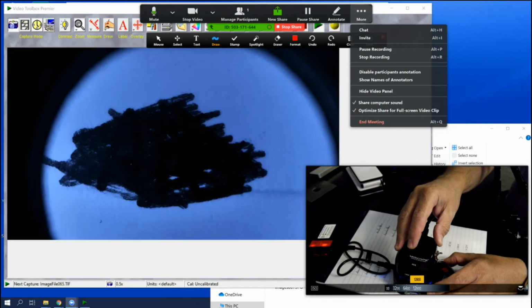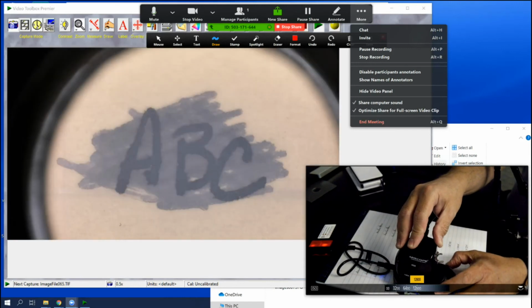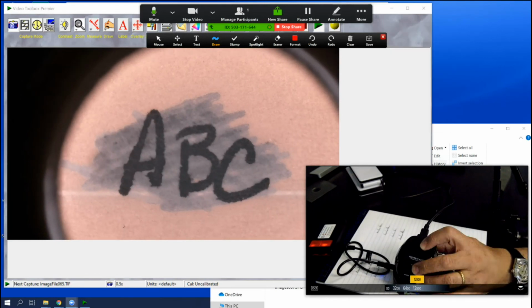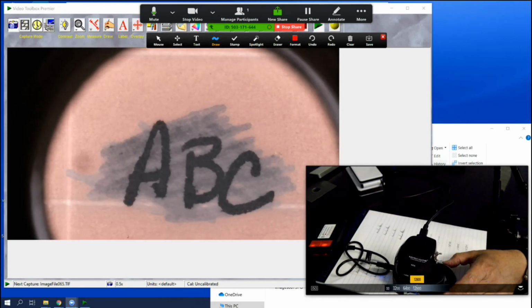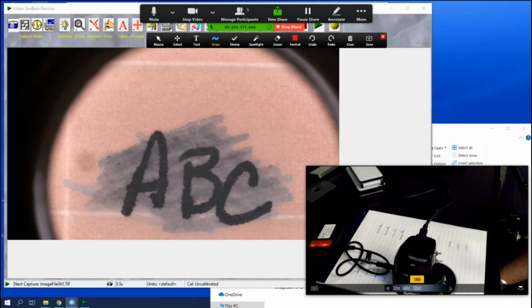The same in an obliterated sense. Oftentimes, the filter wheel, because of the difference in luminescence, can identify variations in inks that are much more difficult to determine with other tools by themselves.